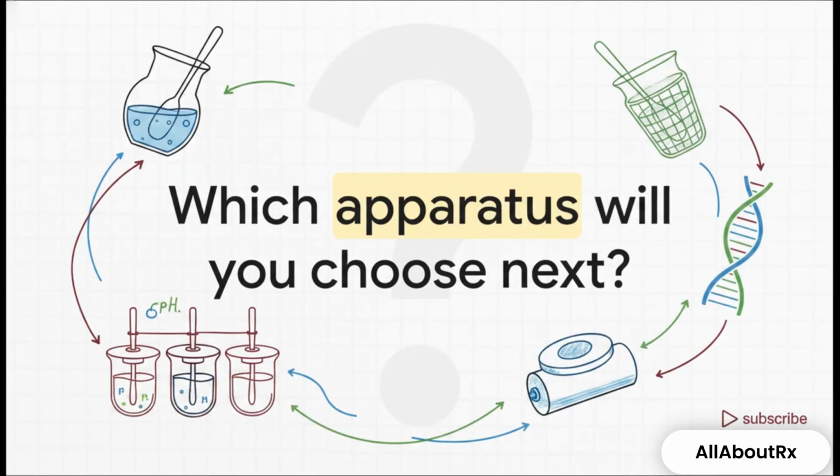With all of that safely categorized in your mind, I'm going to leave you with a question. Based on everything we just covered, which apparatus will you choose for your very next formulation? Seriously, think about the physical properties of the drug and the environment it needs to release into.